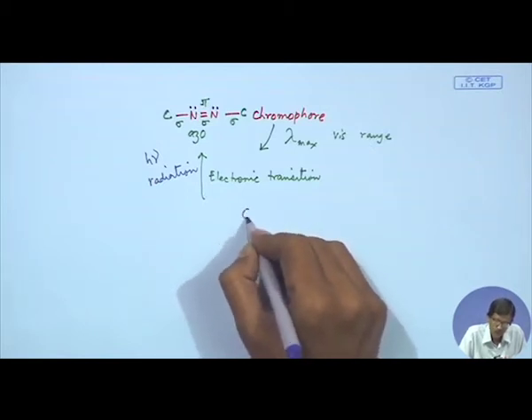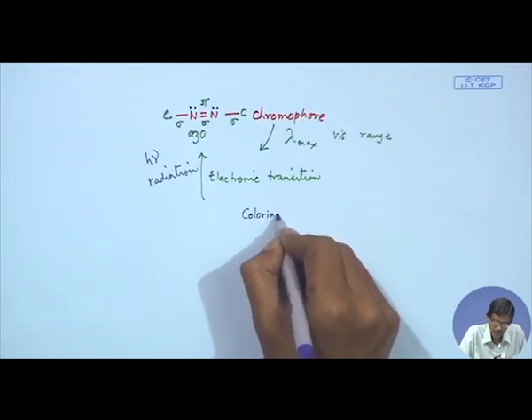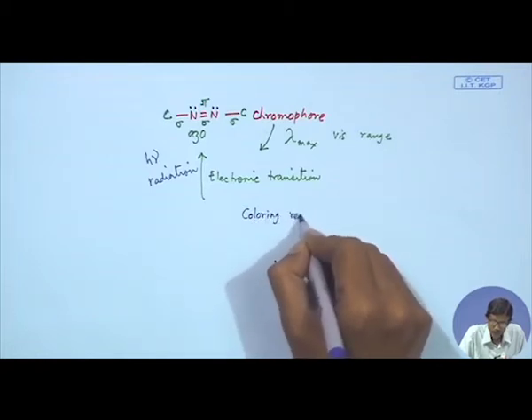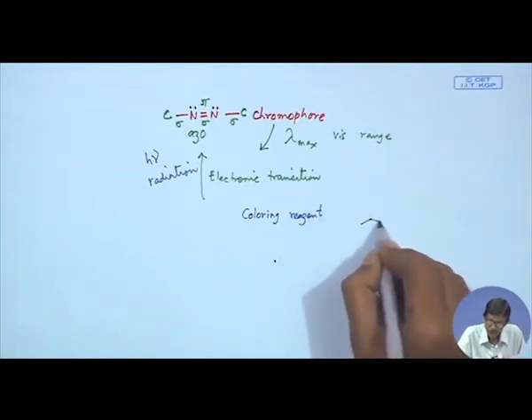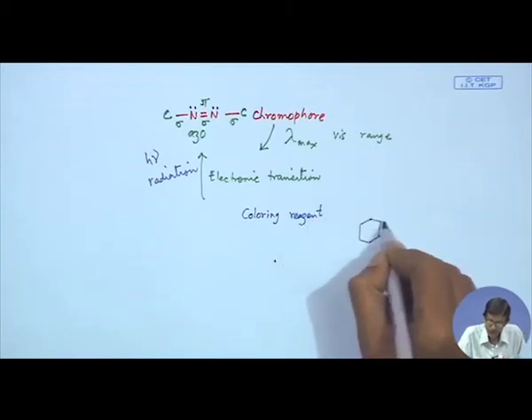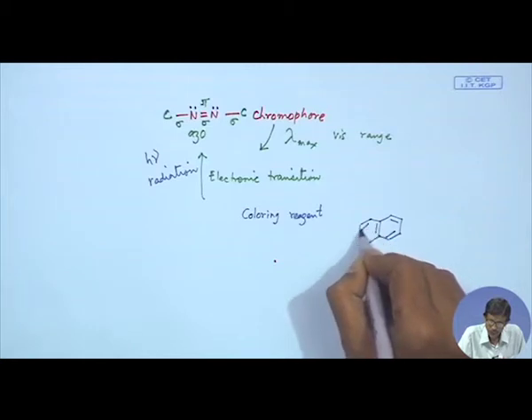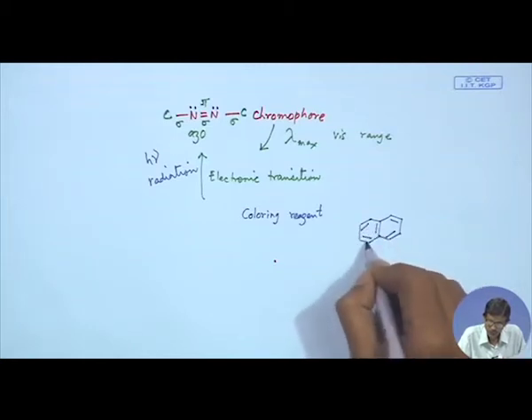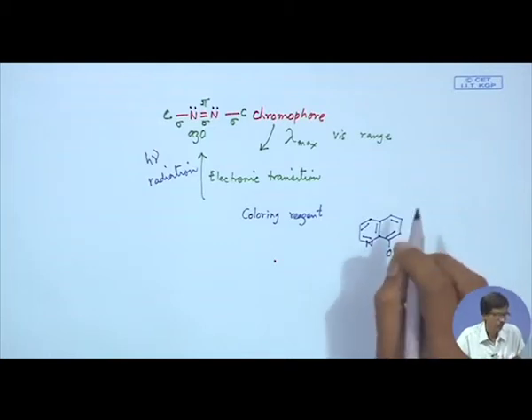Now, we consider it as a coloring reagent, and the name we have written is 8-hydroxyquinoline.